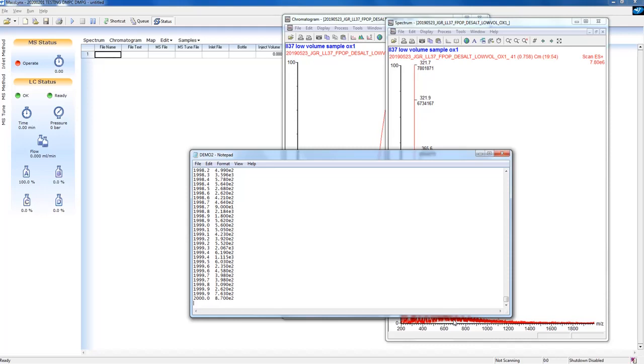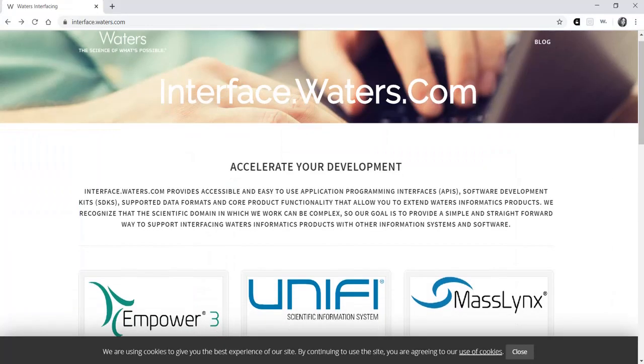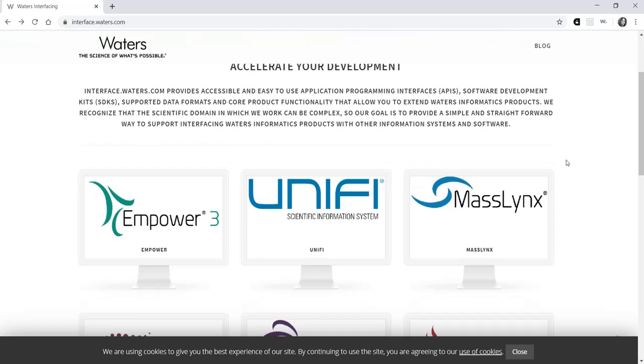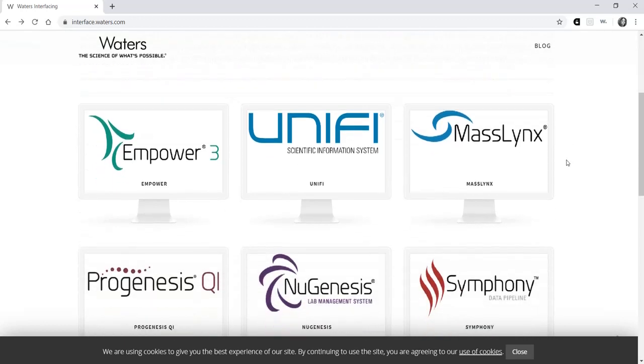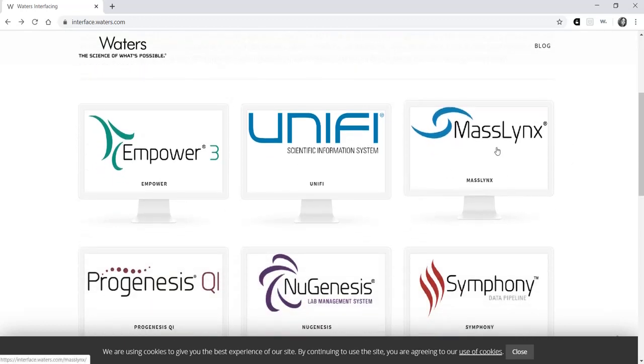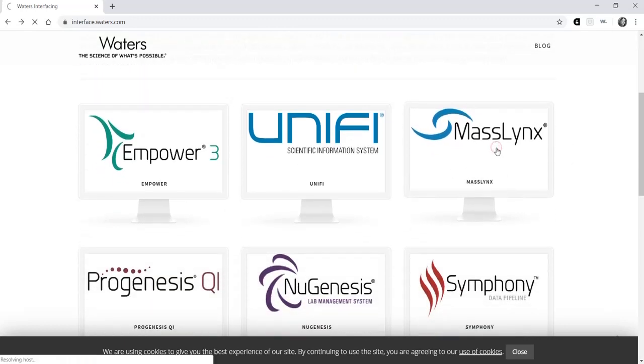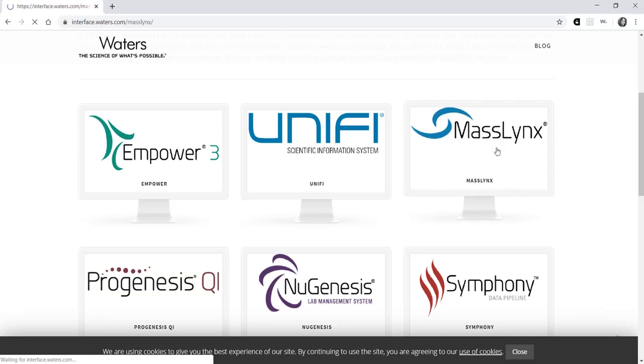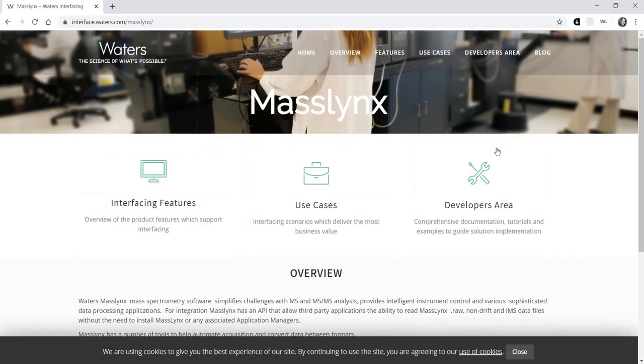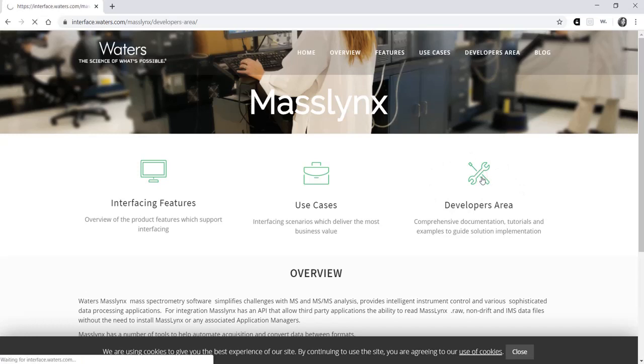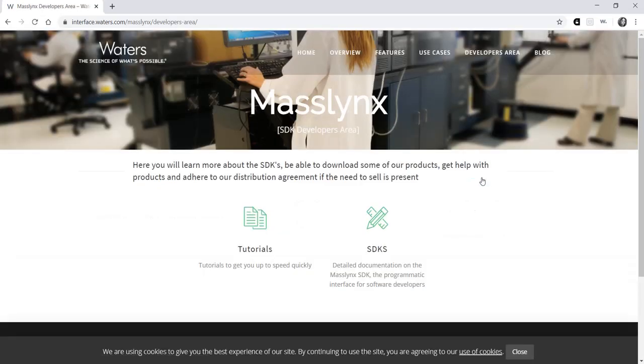You can also open Waters files natively by installing the correct libraries from Waters. You will need two additional files to process data with Unidec. Log in at interface.waters.com and click the MassLinks icon, then go to the Developers area and then SDKs.